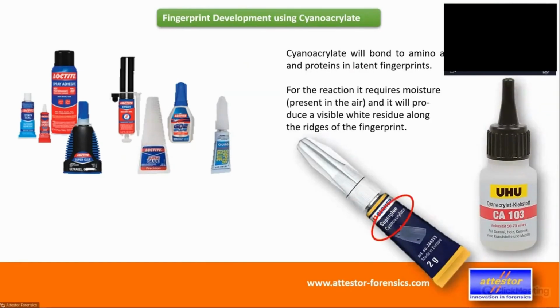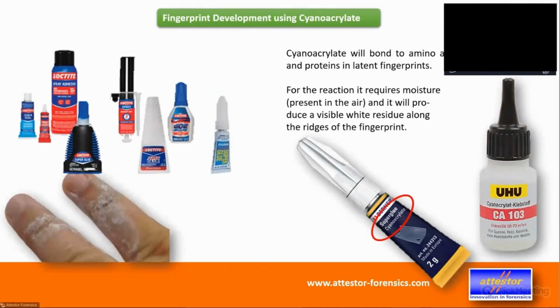The only reason why I left that slide in is that one. We all know if you glue something with cyanoacrylate, the stuff never sticks on the plastic material you want to glue, but it sticks terribly on your fingers, right? To be honest, the purified cyanoacrylate we are using in forensics is perfect for medical purposes. This is the same stuff that a doctor would use if you have a cut in your forehead or something like this, to glue it. But it does not really adhere or stick very well to plastic material.